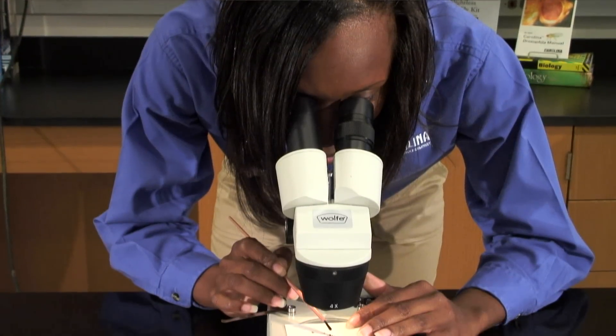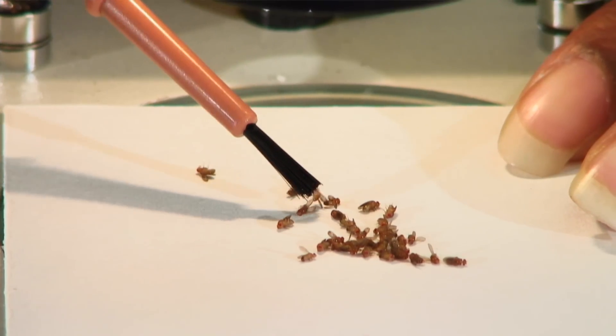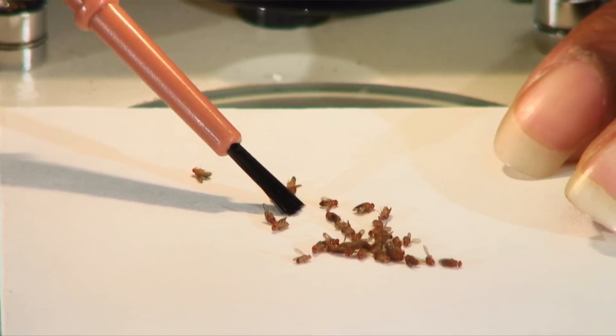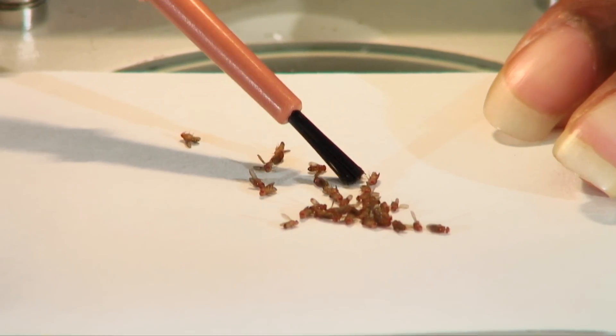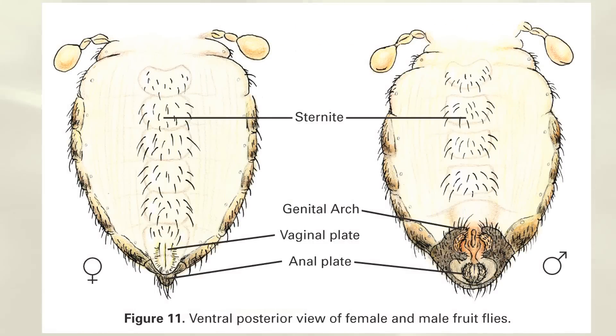Using a fine brush, sort the flies into groups of males and females. In general, the posterior part of the abdomen is much darker and more rounded in males than in females. Also, females usually are larger than males.